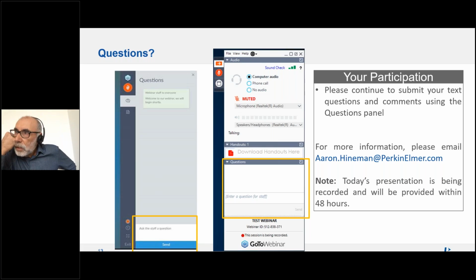Okay, thank you. Next question is about the main difficulty in determining microplastics in ICPMS. The question states, do you believe that the main difficulty in determining microplastics is the high background for samples containing high carbon concentration? Yeah, of course.